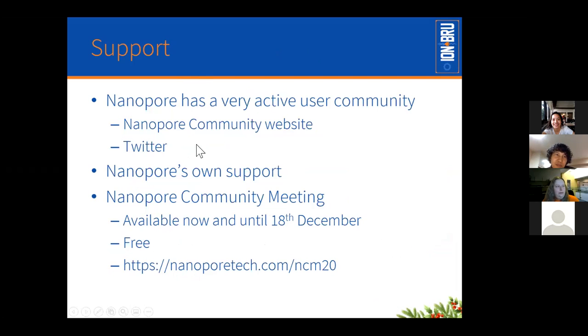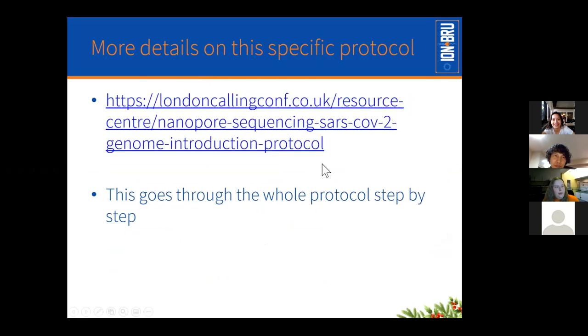There's a lot of support available, a very active community on the website and on Twitter. Nanopore do have a support line you can email. And the Nanopore community meeting just finished, but it is still available online, so do go and watch some videos on there. There's also a very detailed walkthrough of this protocol, which is why I didn't go into much detail. This video already exists. It's a step-by-step of the entire protocol for this library prep.